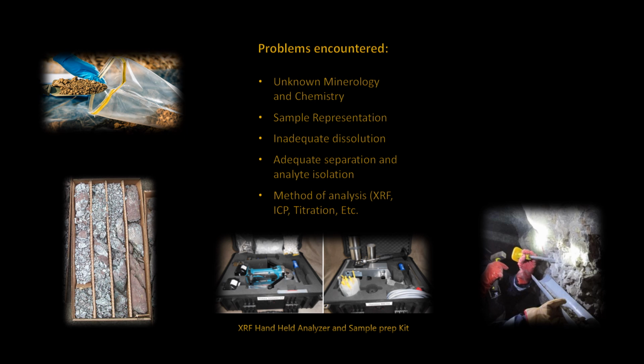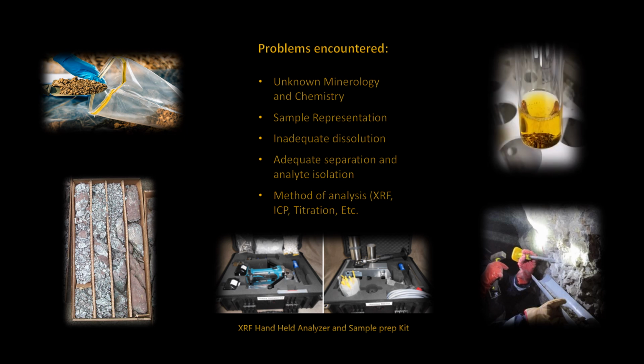The overall objective is to be able to dissolve your sample completely in order to obtain a homogenized aqueous solution for subsequent separation and isolation of the analyte to be assayed, that is, to be analyzed for mineral concentration.